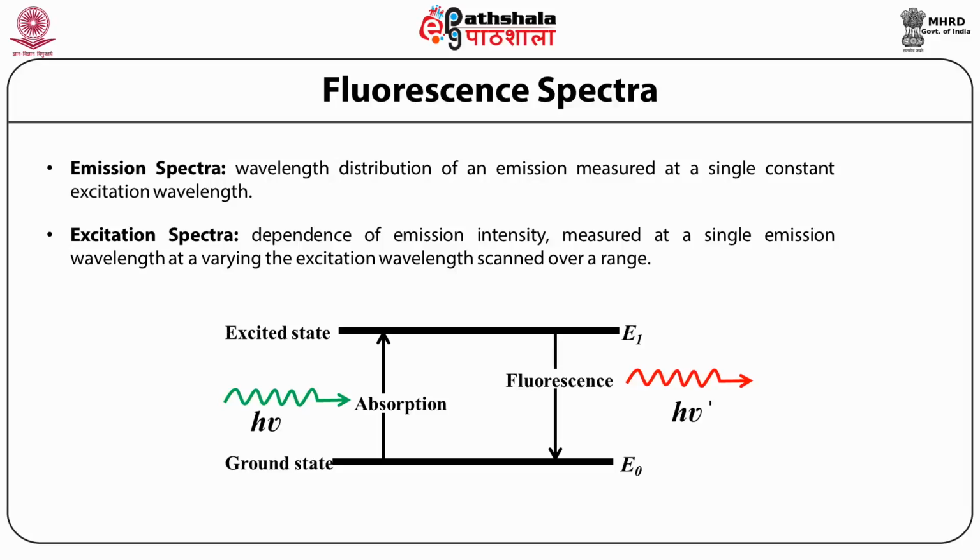Thus, the fluorescence occurs at a longer wavelength than the absorbed one. The energies and intensities of fluorescence give information about the structure and environment of the fluorophore.